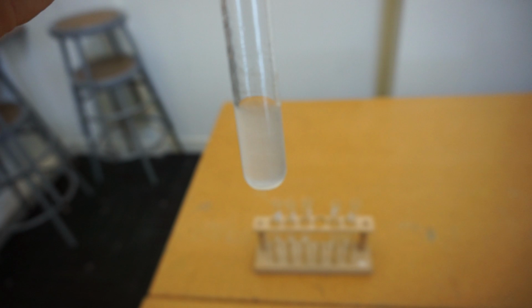Now we're getting to butanol, and with butanol, for the first time, we're starting to see a cloudiness in the solution, which is perhaps suggesting that things aren't mixing as well as some of the others have. We're starting to see a clear solution at the bottom, and if you look here, at the middle here, there's actually now an interface. We have two separate colourless liquids. The alcohol and the water are no longer mixing.